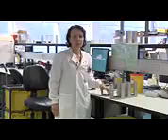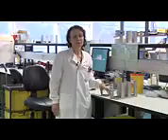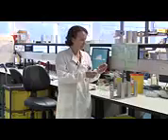This bench is our respiratory bench. Here we process samples from the upper respiratory tract, including ear swabs, eye swabs and throat swabs. And samples from the lower respiratory tract are processed in containment level 3, and samples include the sputum samples and bronchoalveolar lavage samples. They are processed at containment level 3 because there is a risk of the sample containing tuberculosis. Throat swabs are processed for organisms such as group A streptococci, ear swabs for Haemophilus infections, and eye swabs you can have Staph aureus conjunctivitis. This plate shows a group A streptococcus from a throat swab.